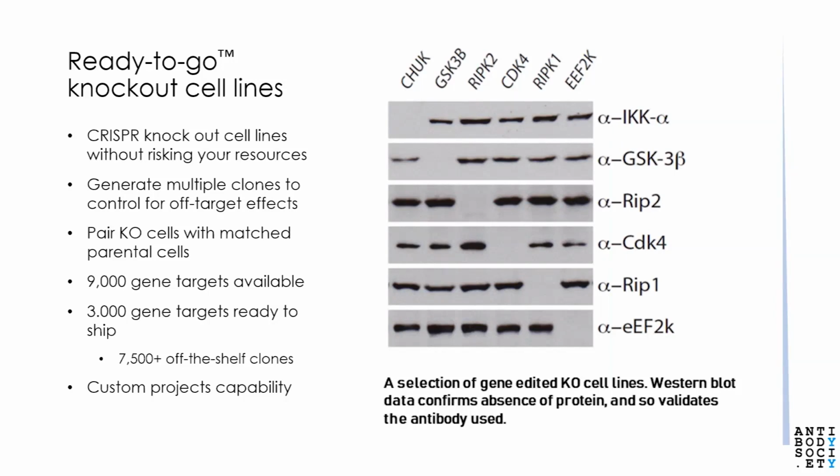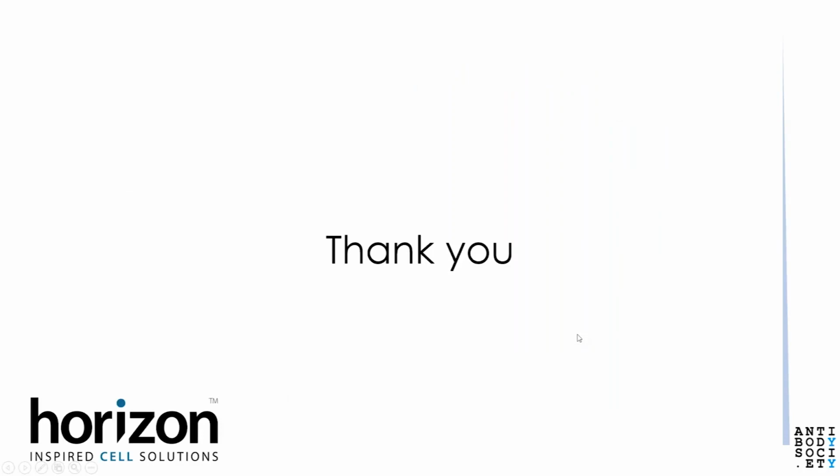And as you can see, you can really validate the antibodies by the complete ablation of the protein, as you can see across this panel of cell lines that we have. And so I think with that, I will say thank you for listening, and I will be open to answering any questions you may have.